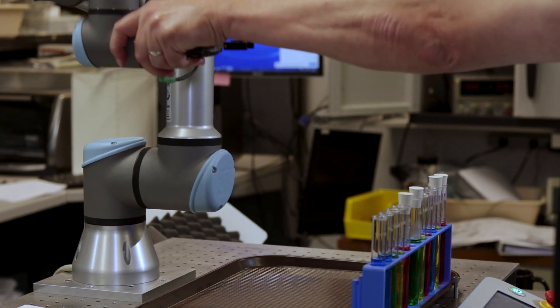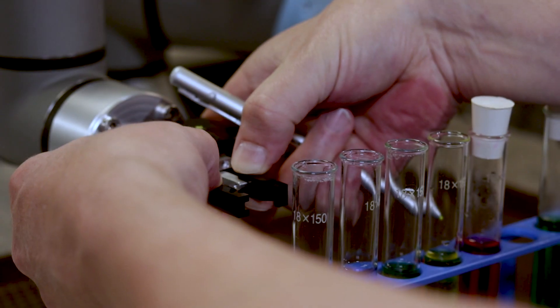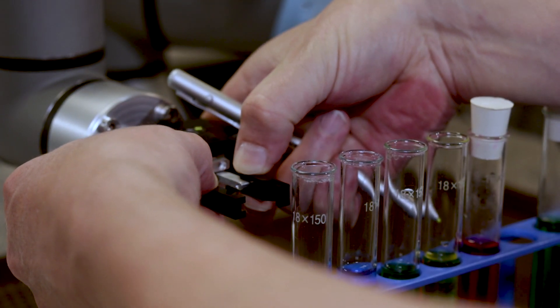The hands-on approach to teaching the Universal Robot also extends to the NSRPG, allowing you to physically show the robot the best way to grasp each item.